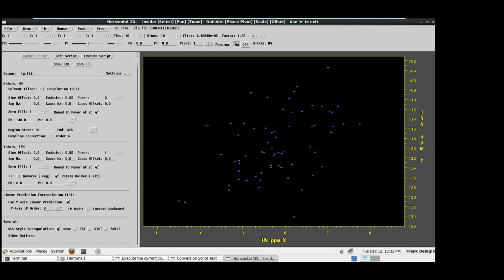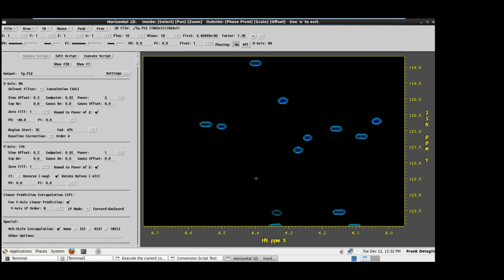And there's our linear predicted result. Come in here, have a look. Nice.